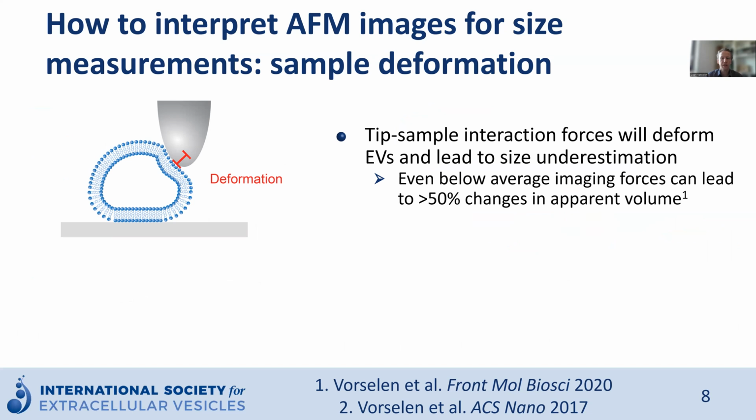Finally, particles, including EVs, will also deform due to the forces that are exerted by the AFM tip on the particle during imaging. We have previously shown that even small imaging forces can lead to an underestimation of vesicle size by 50%. And this is why it's so important to minimize forces between the tip and the sample during imaging. For example, using sub-resonance stepping modes.